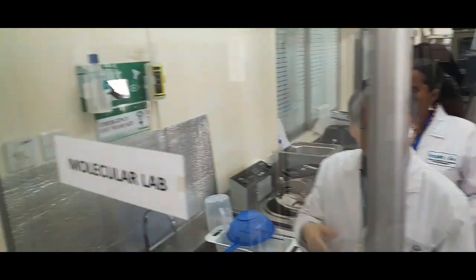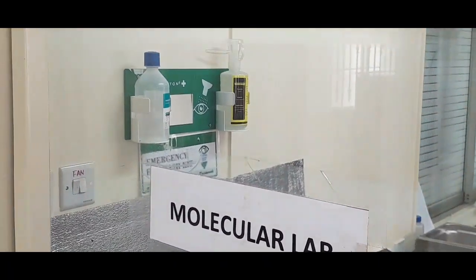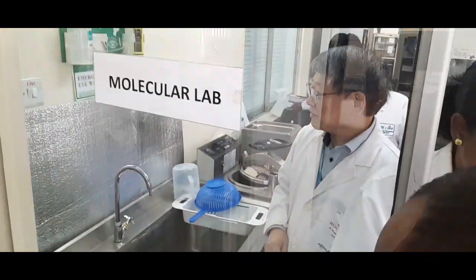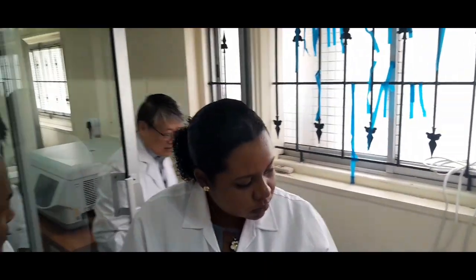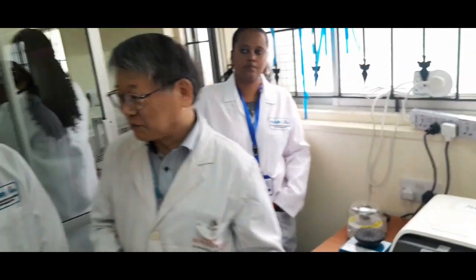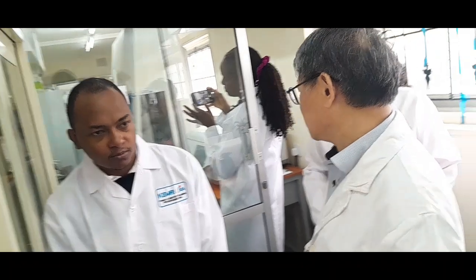Okay. Right. Let's go to your eye. You can immediately wash. Of course, you can wash hands or face here, like that. We don't have a shower. Maybe your institute has a shower. Our lab does not have much space, that's why we have the sink and eye wash.